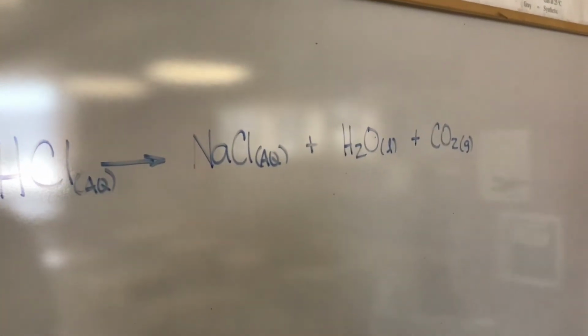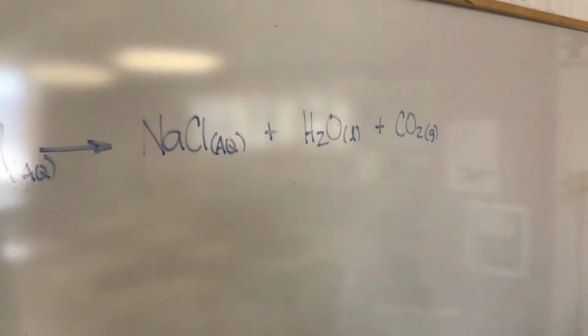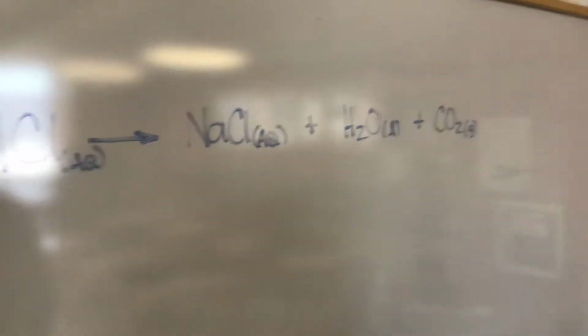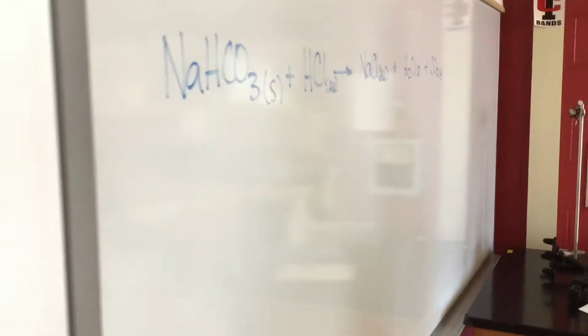Salt, bubbly salt, is that what it is? I see some salt there. Aqueous salt and water, and then CO2, the gas. Yep. So there's our reaction.